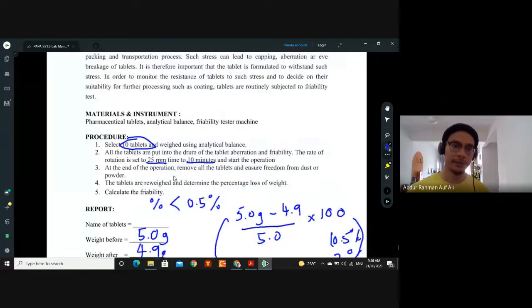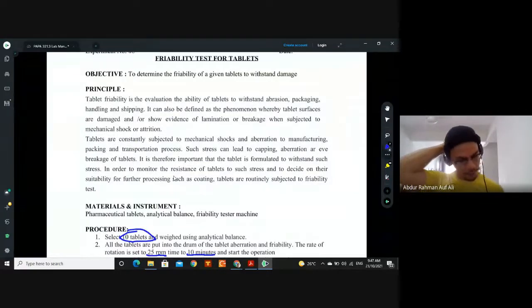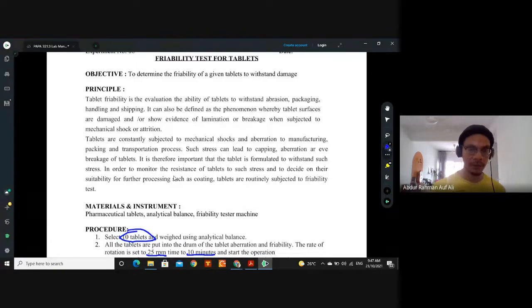That's basically it. Okay, so this test kita dalam in the industry, if you work in a pharmaceutical quality control lab, we perform this on every tablets. Kalau fail, we need to either repeat ataupun kita ada procedure untuk fail test. Contohnya kita take another 10 tablets randomly, perform lagi sekali. Okay, so kita tengok how much lagi rosak. Kalau more than 0.5%, maybe kita boleh stop production.